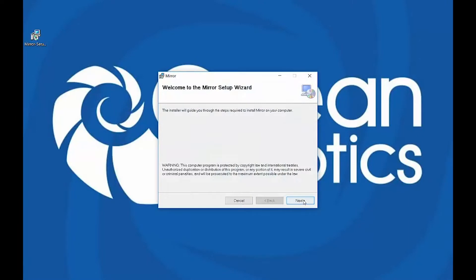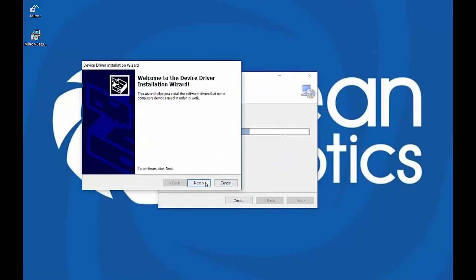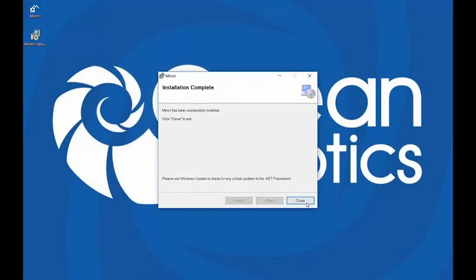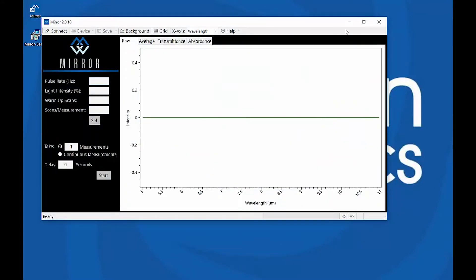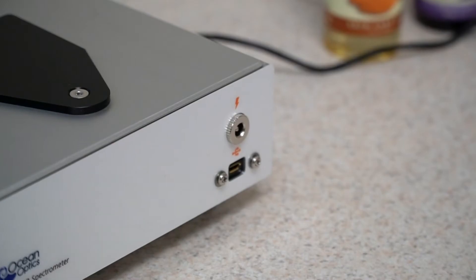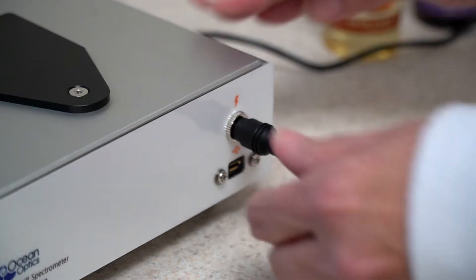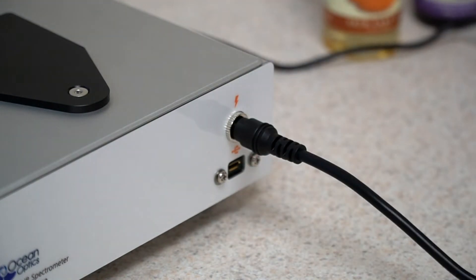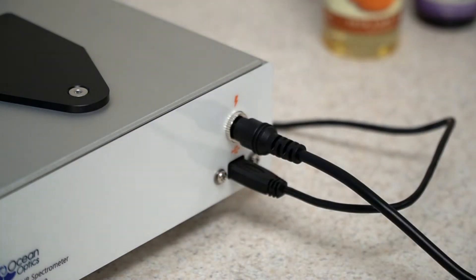We're now ready to get started. First, install the OceanMirror software. Once installation is complete, start the OceanMirror application. Next, connect your MZ5 to the provided power supply and plug it into an outlet. Then, attach the micro-end of the supplied USB cable to the MZ5 and plug the cable into the computer.